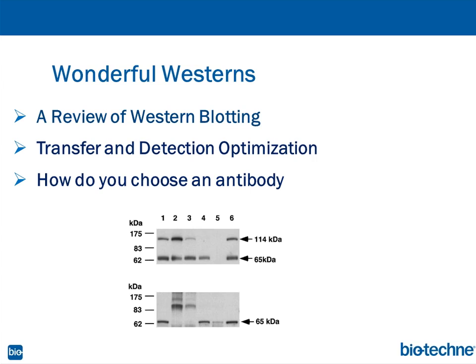The third thing I would mention is we're going to do this talk in the order of transfer optimization, followed by detection. Because think about it. If your protein is not out of the gel and onto that membrane and into the membrane, and by the way, proteins not only bind to the top of the membrane but into the membrane, you're never going to see it.